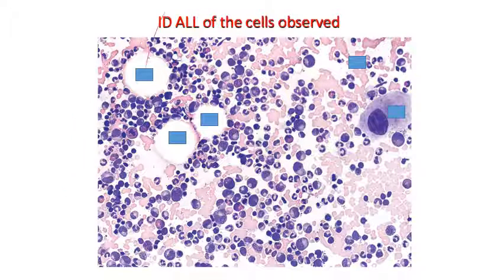Okay, again, adipocyte. Okay, we see a sinusoid right here. Look at the red blood cells. Okay, all right. Again, the adipocytes are going to be washed out because we use the alcohol to remove them when we fixate the slide. Again, this is a megakaryocyte. We have another sinusoidal space. These red blobs right here are going to be our erythrocytes. Okay, so you'll notice that we have a really big sinusoid right here, and some of it may be due to artifact because it's been broken up. We have an eosinophil right there. That's probably a basophil. Basophil. Look how much bigger the megakaryocytes are versus all the other cells. It's a really big cell. You can pretty much guess, hey, that's not going to be a basophil, not a lymphocyte, it's a megakaryocyte.